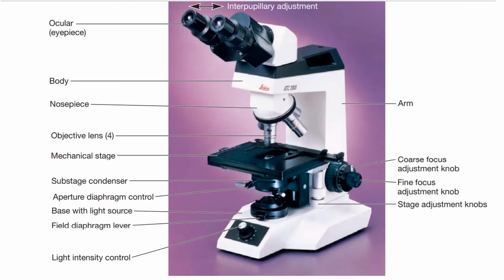Now here, see the parts of the microscope. Observe everything. We started with the light source, right? So there is your light source. Here is your light, and this is basically your diaphragm. This thing is your diaphragm, and that's how light comes. See, there's a bulb here. If there's no bulb over here, there could be sunlight, but there's a bulb, then there's a diaphragm, and then there's what is called the condenser that helps in focusing the light.